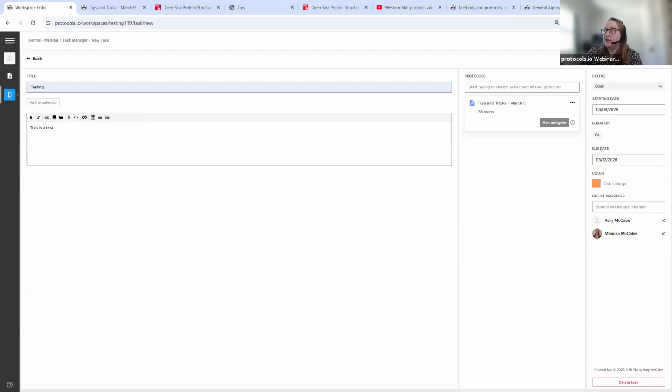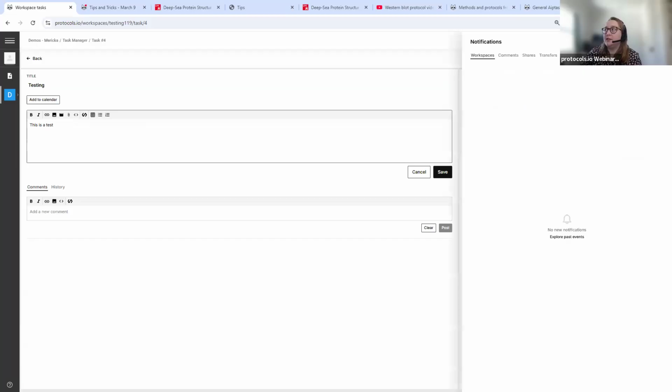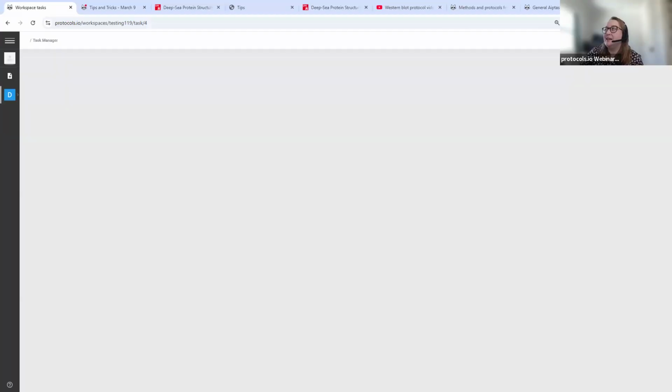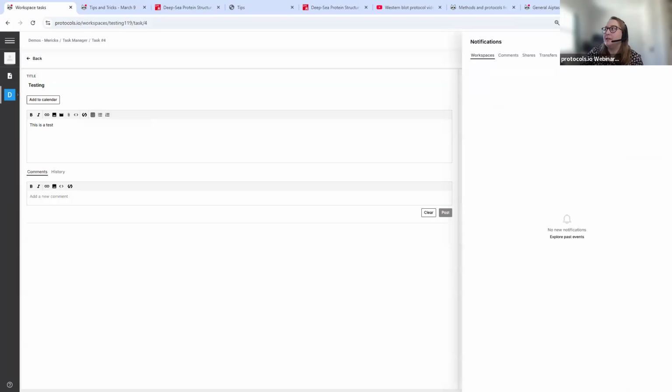Let me save this task for a second. And that's saving. And now I can see a notification. I have to refresh. I'll get a notification telling me that a task was assigned to me, and I can view that task.